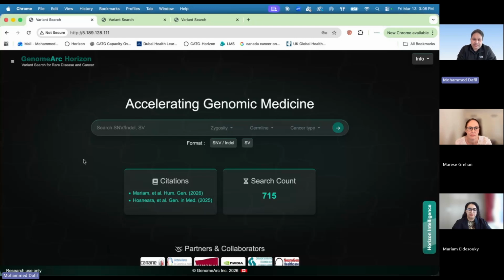So this is the page that is now accessible globally to anybody who is registered to our account, and it's free to register. Registration is very simple.